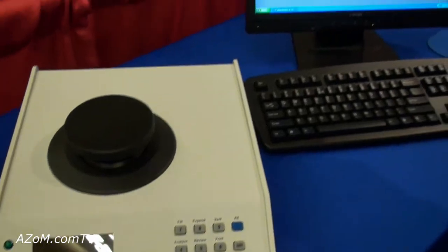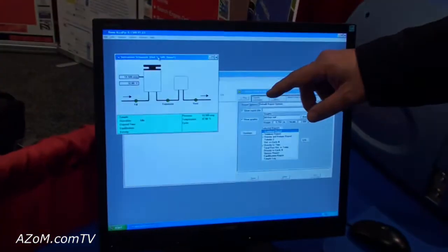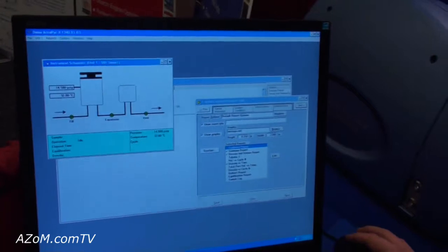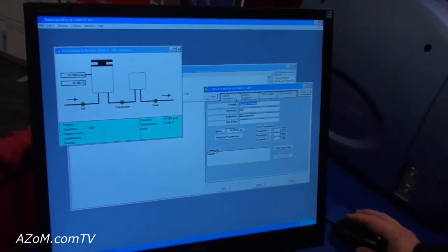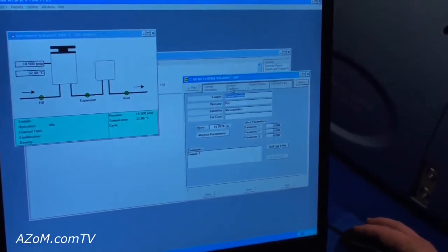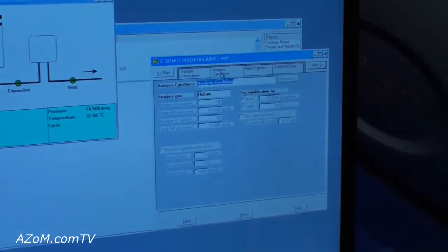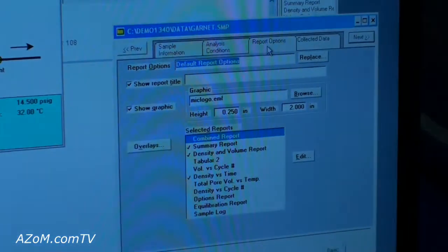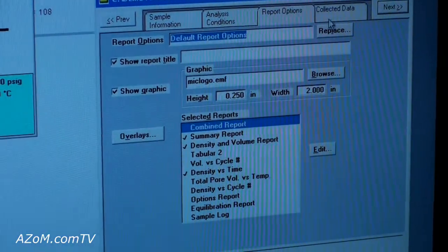If you look at the software, we have the same ability to do all of those things in a sample file but we have a lot more flexibility for information about the sample, the analysis conditions and then many different report possibilities once we have collected data.